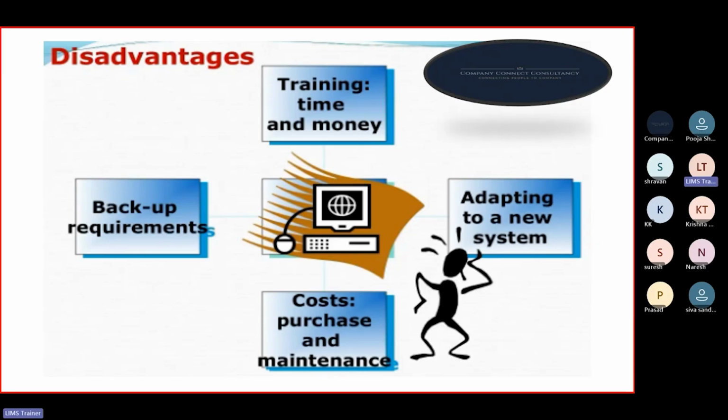That requires a lot of time and a lot of training for the personnel on how to perform their tasks in the software. So it is a headache to train the personnel. Some people can adapt to the new system, but the older people, who have 25 or 30 years of experience, are not used to this new system, so they will take time to adapt. This will be a headache, and this is a disadvantage of the LIMS.